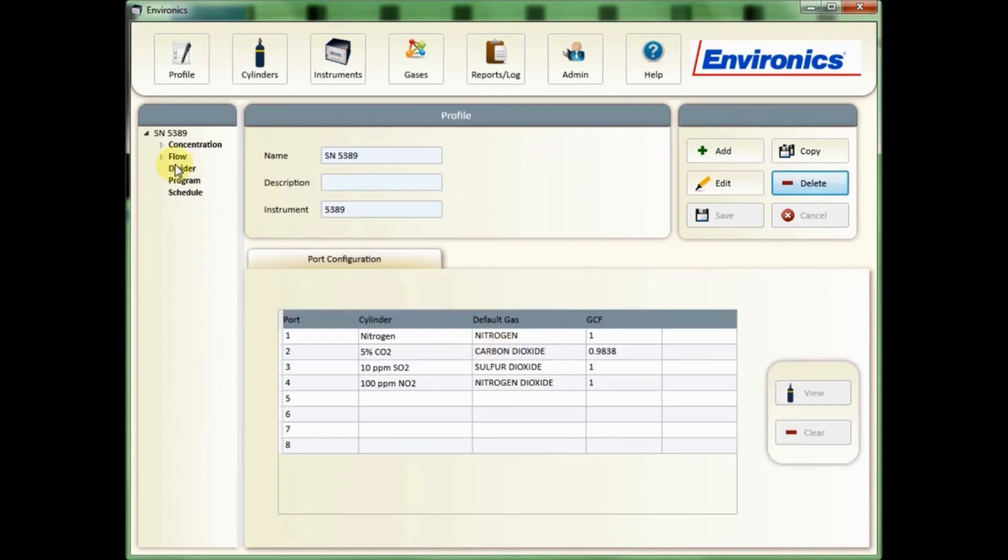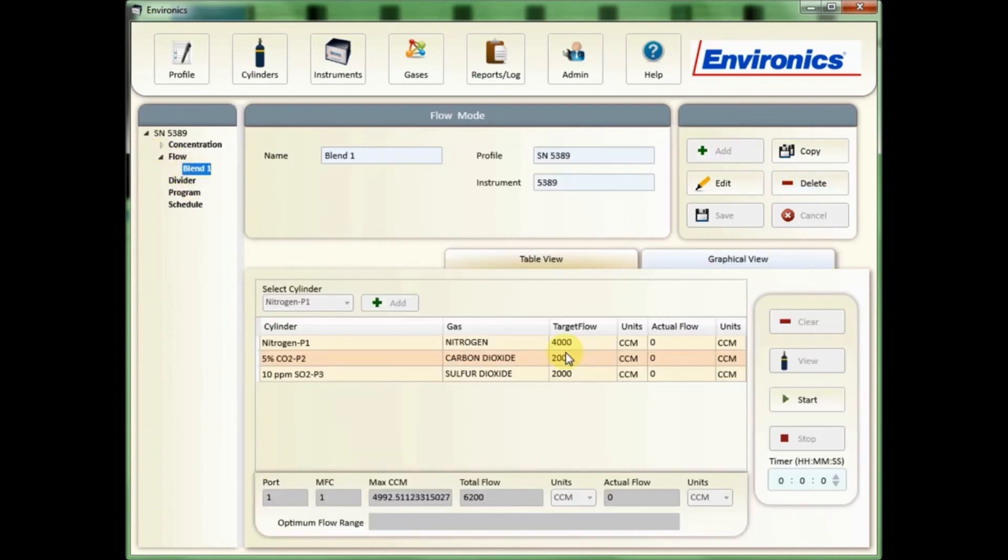In order to run a flow mode, select the mode you want, click the start button. Once you've done that you'll see the timer will begin, you'll hear your unit begin to flow. When you're done, simply click on the stop button.